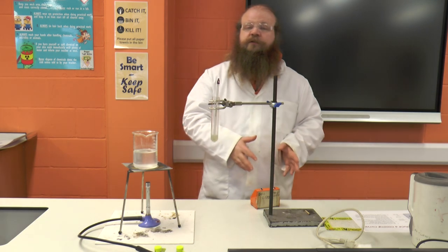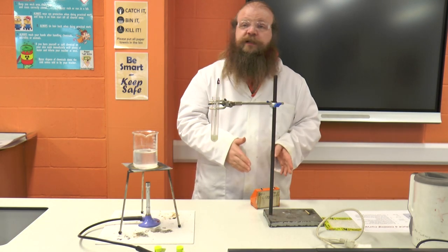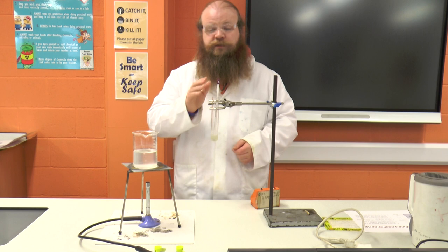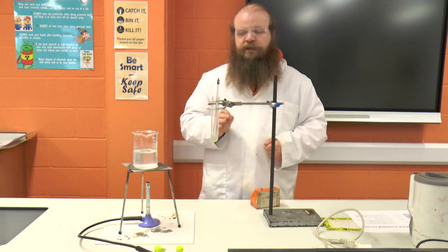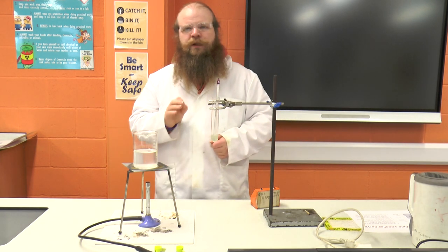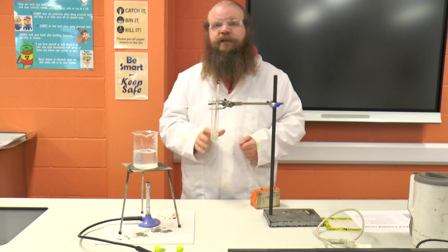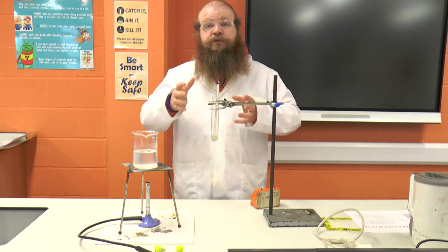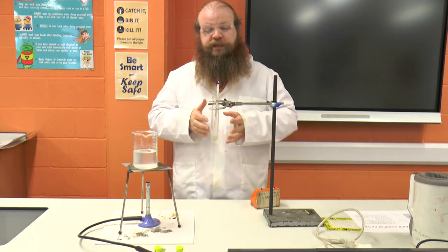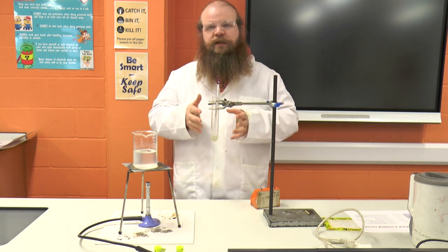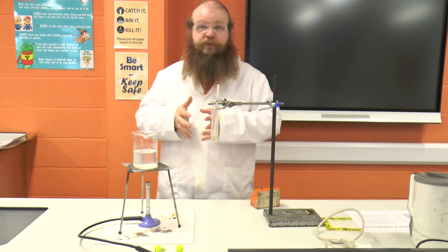We're going to press start on the stop clock and then every 30 seconds take another reading. It's important that when you're taking the readings you don't take the bulb of the thermometer out of the liquid — it must stay in the liquid — otherwise you're going to be getting a temperature change. There's also a slight lag in how the thermometer changes because it's a liquid-in-glass thermometer.